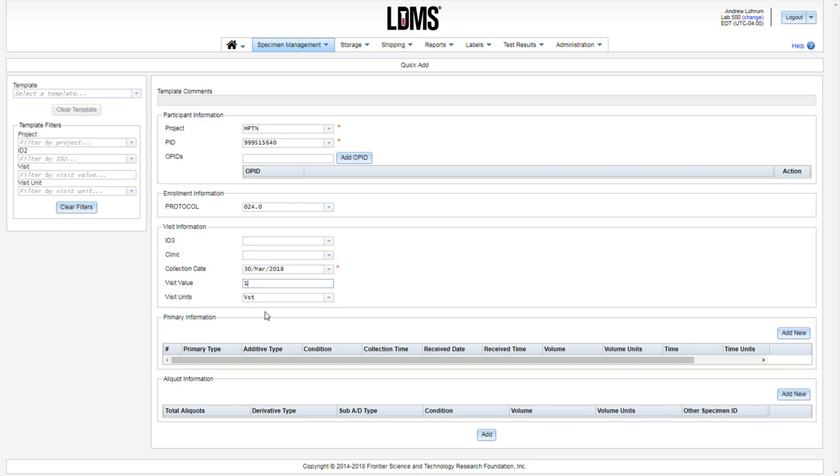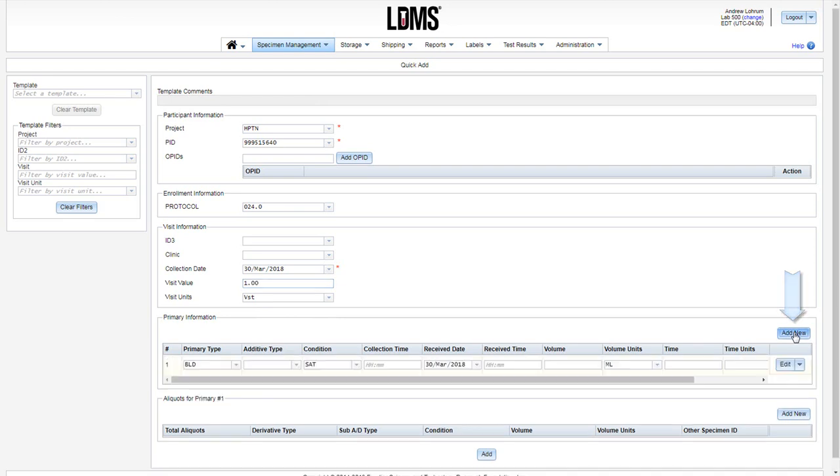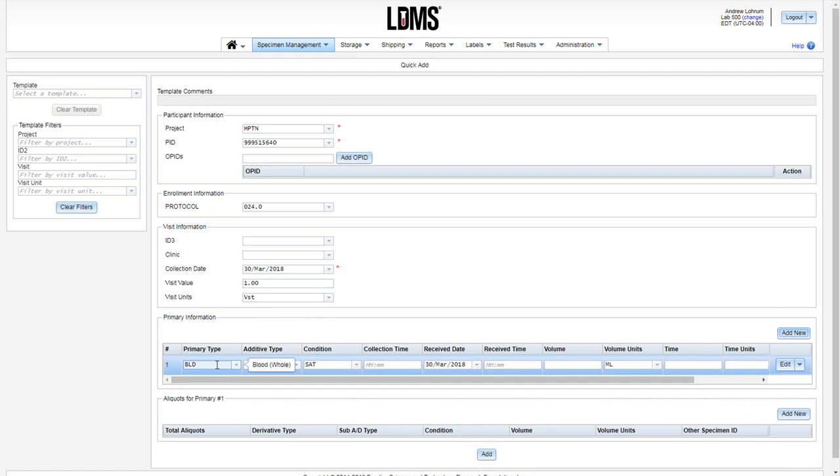Our next section is for our primaries. Add a new primary to this draw by clicking the Add New button over to the right at the top of the grid. A line will appear. The primary type will be auto-set to BLD or whole blood. You can change the primary if necessary.